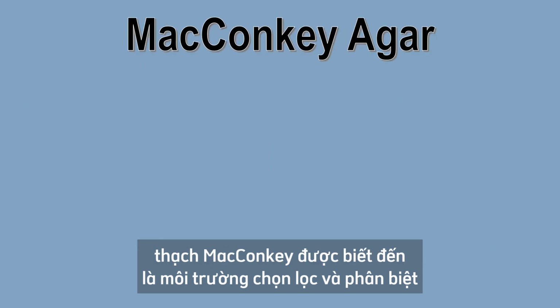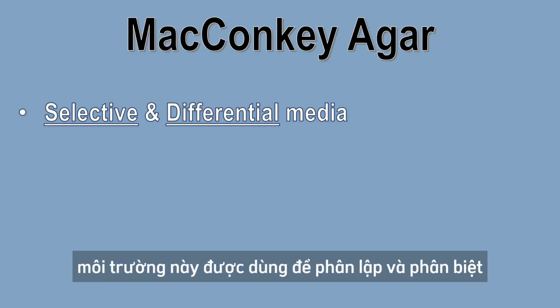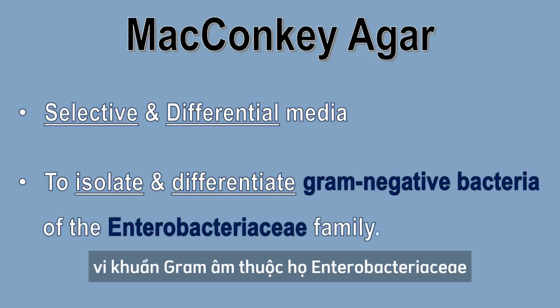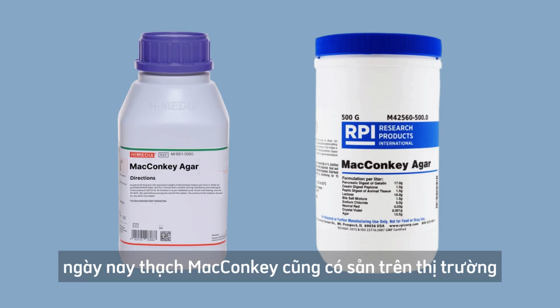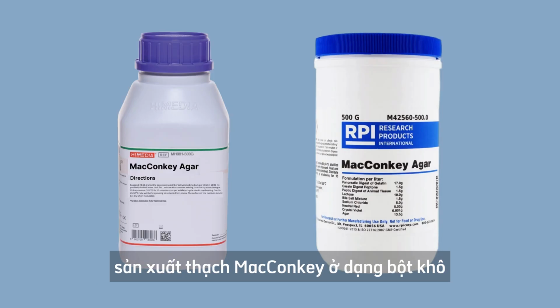MacConkey Agar is known as a selective and differential media. This media is used to isolate and differentiate gram-negative bacteria of the Enterobacteriaceae family. Nowadays, MacConkey Agar is also available commercially. Companies like HiMedia and many others manufacture MacConkey Agar in dehydrated forms.